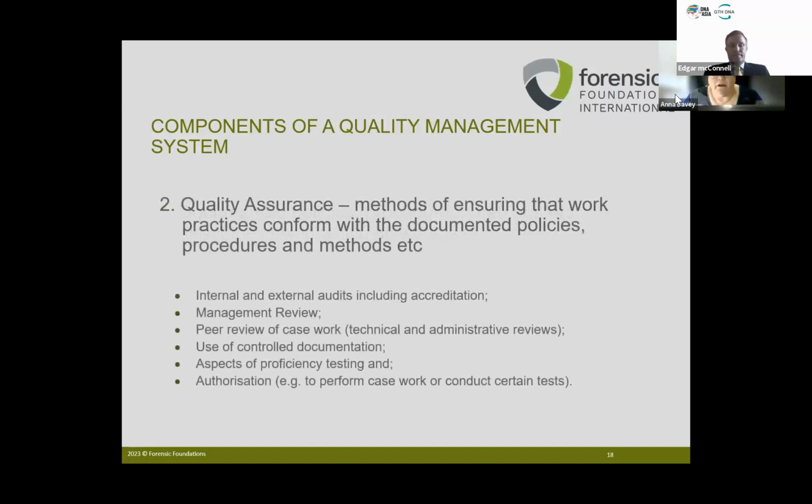Talking about following, that leads us to the second point, quality assurance. Methods of ensuring that the work practices, what people are actually doing, whether we're talking about on the bench doing the DNA extractions, the amplifications, whether it's sitting at a computer doing the interpretation or the DNA database searching, or sitting at desks writing reports, but all those work practices conform with the documented policies, procedures, and methods.